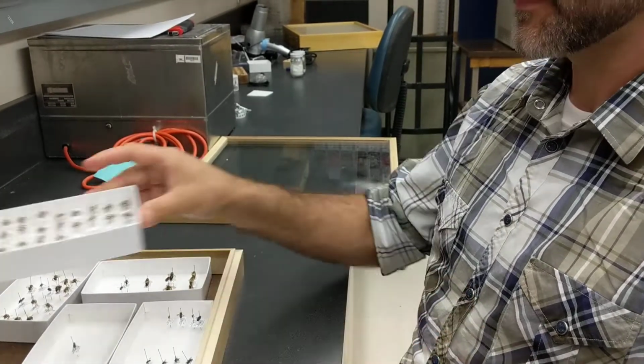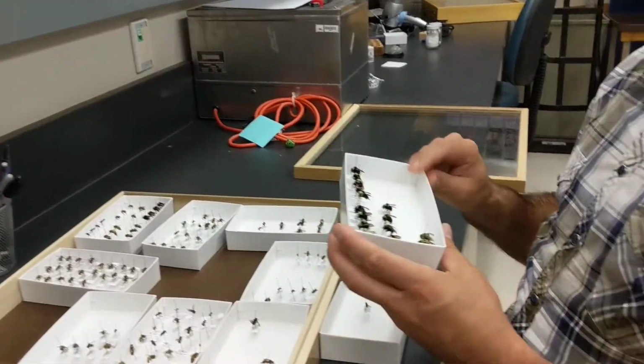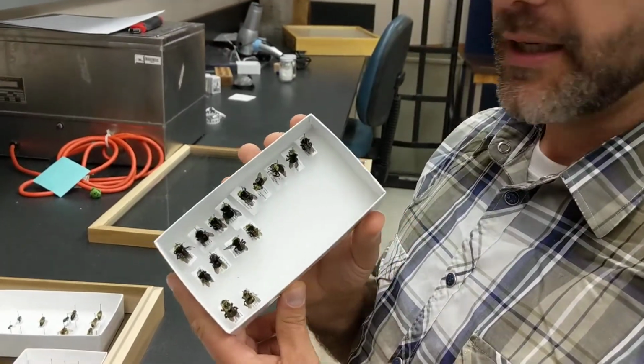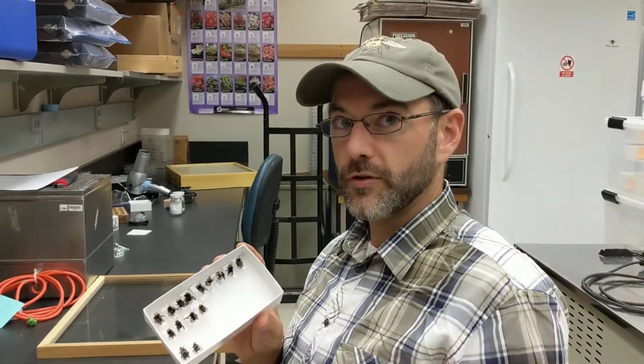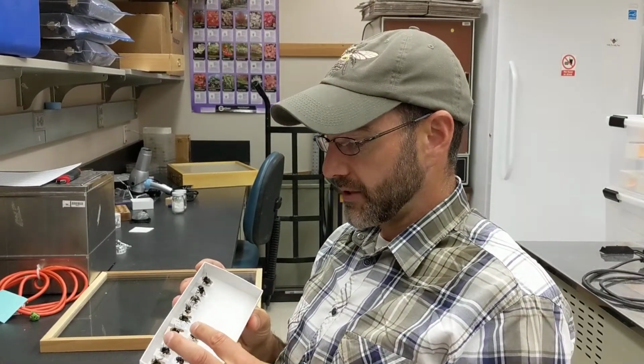So Lincoln, this is for those who took the bee course, they were used to having the specimen and working through the key. This would be before working through the key. That's right. What you would do is you'd pull out everything that you think is a bumblebee. You'd sort them into what you think might be different bumblebee species or morphospecies or different groups, and then you would run them through the key.